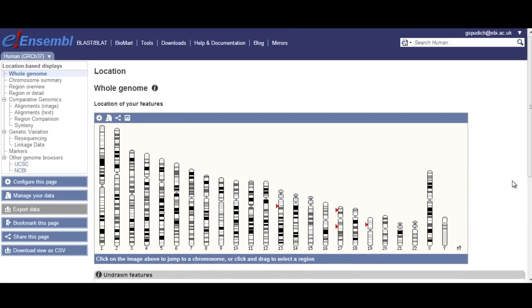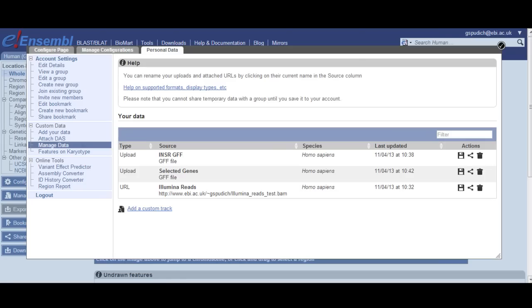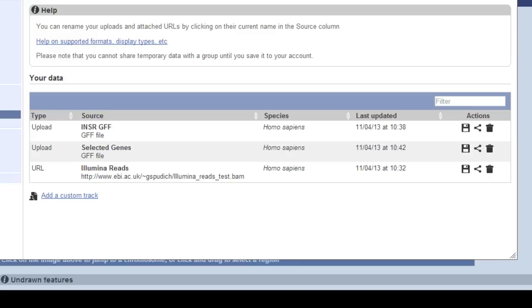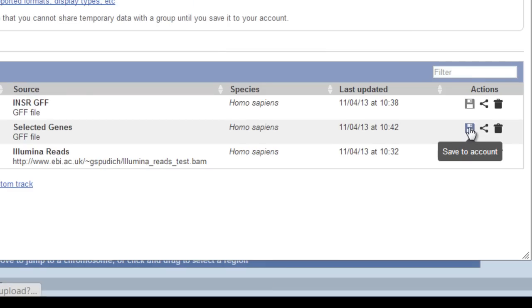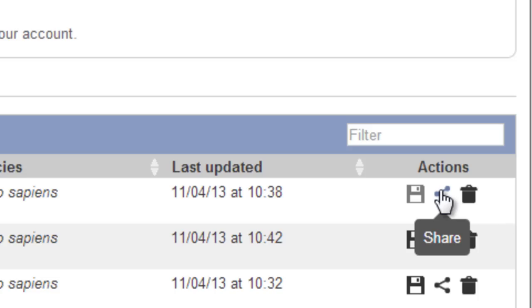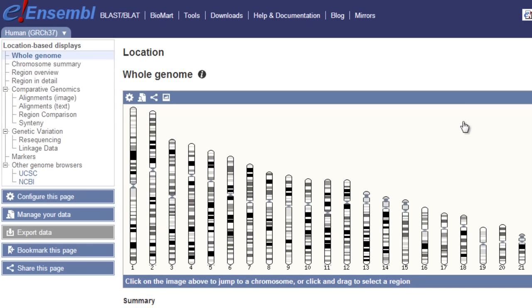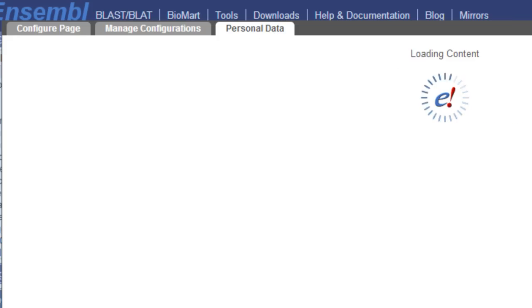You may have noticed that we're collecting all our data tracks, and can see them in Manage Your Data — now I can see three sets of data. However, they are not saved to my account. If I want to save them, I have to click on the floppy disk icon. Now it's saved and the icon is grayed out. Once you save a set to your account, you can see it any time you log in from any computer. Note there are other actions you can take, like deleting a data set completely or sharing it with a collaborator via URL. You can also access the same Manage Your Data window by going to Configure This Page and then clicking on Personal Data.